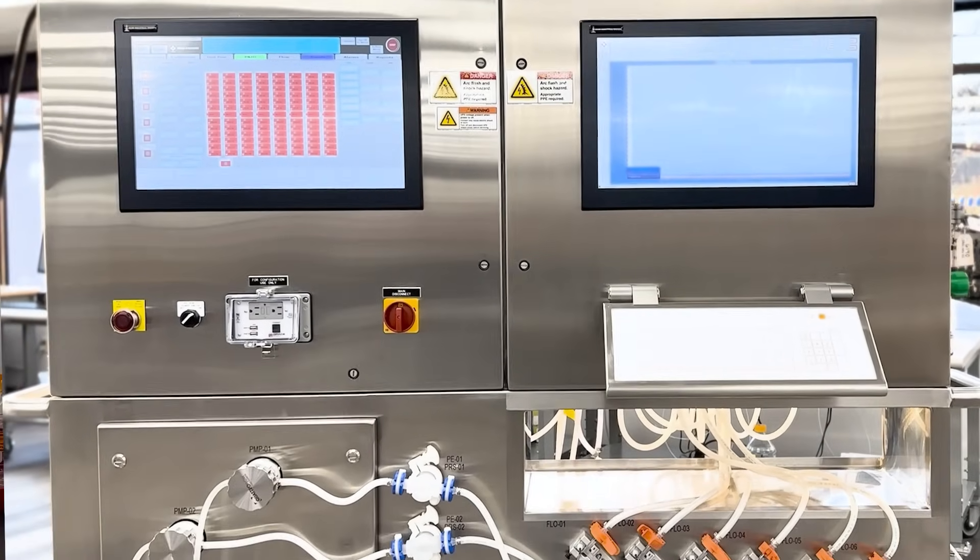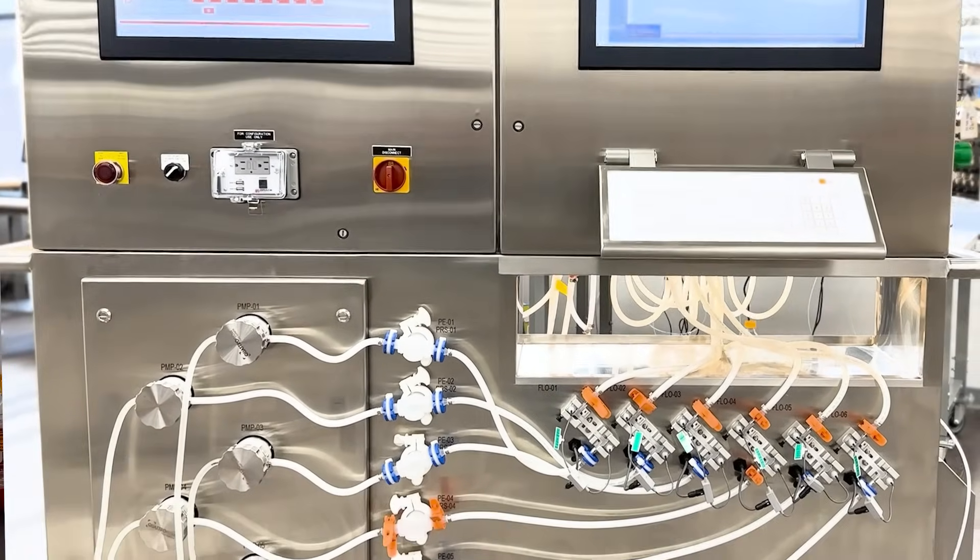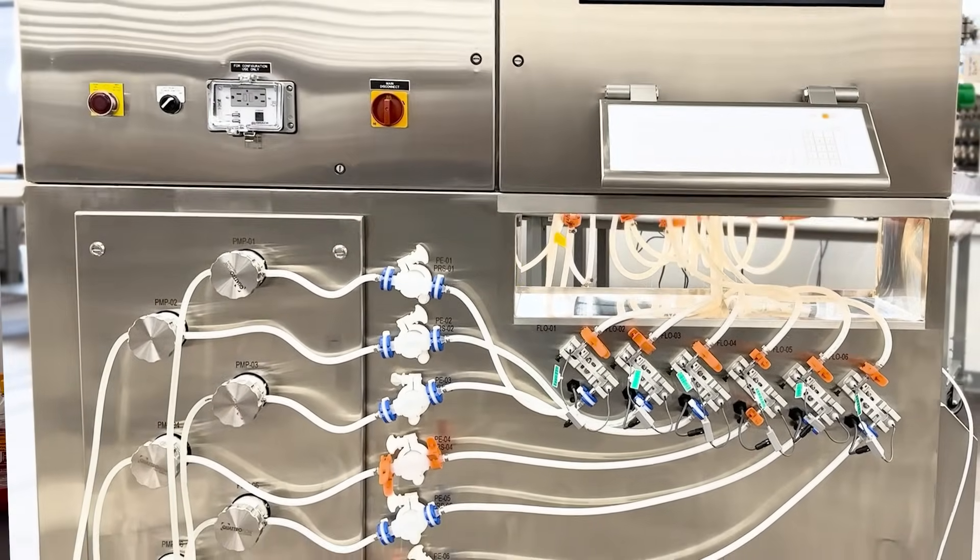Because the systems have the same physical architecture, it makes scaling from process development to clinical and commercial manufacturing very approachable.